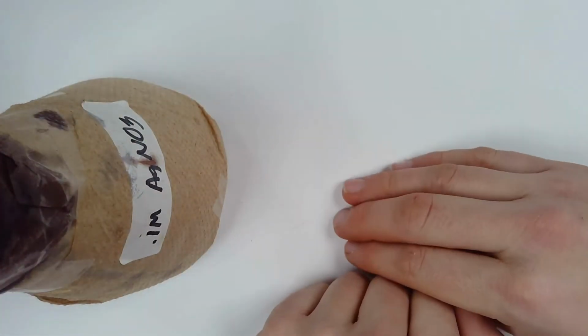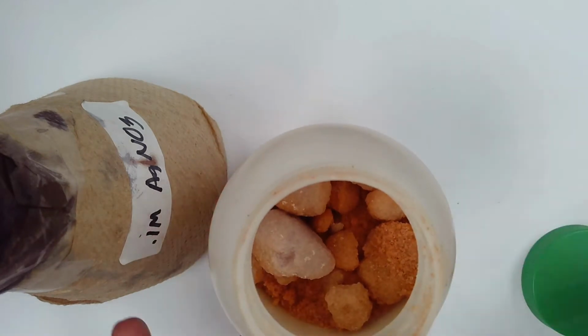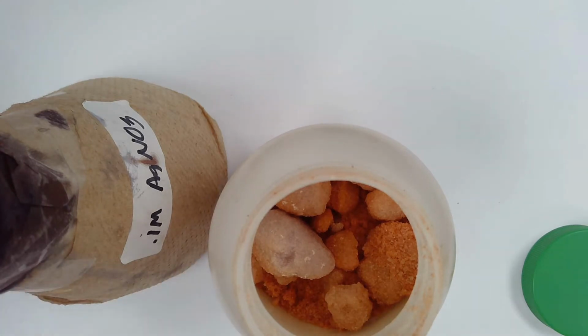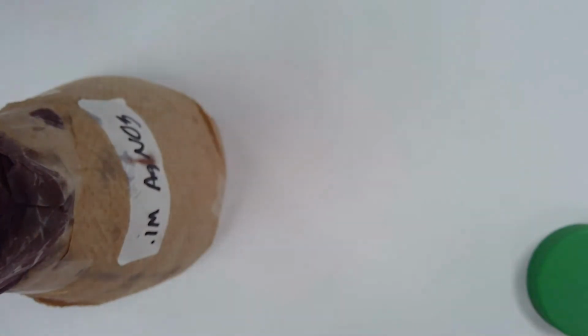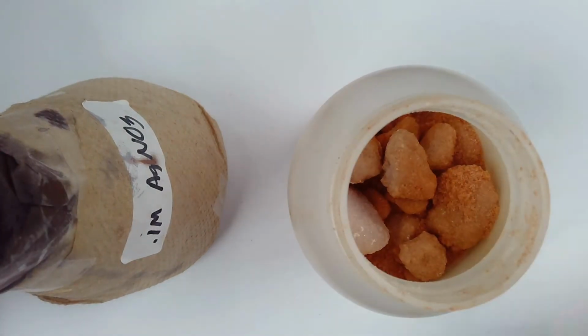Now, the problem is, of course, if I take any of my other things, I think this iron nitrate here is kind of cool looking as I look into it. It's in a solid form, and solid form chemicals aren't going to work for me. And so what I need to do is I need to make this into a solution, right? All of the things I have, including now my properly sourced ammonium chloride, not aluminum chloride, are in that salt form. And I don't want them in the solid form. I want them in a different state of matter, which allows them to break into their ions.